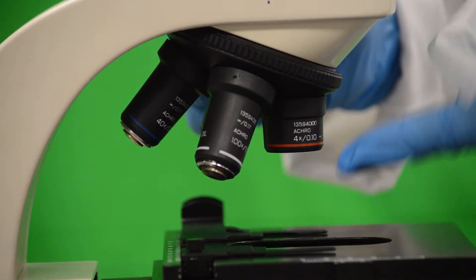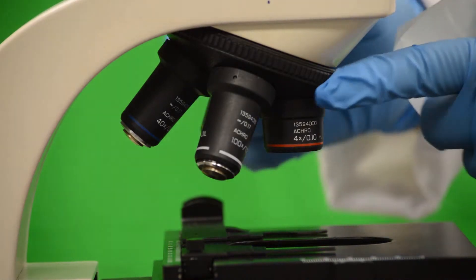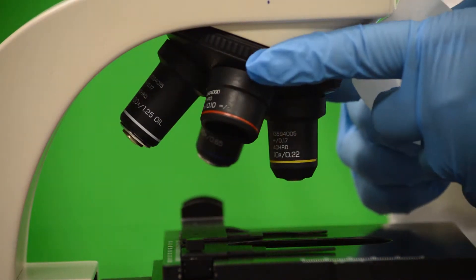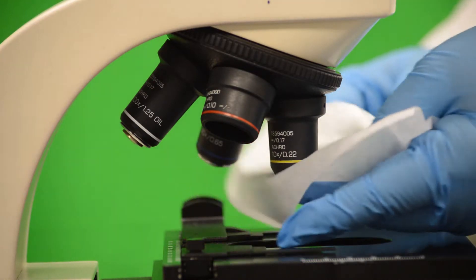Take a sheet of lens paper, crumble it, and spray it once with lens cleaner solution. Now wipe the lens in a circular manner.